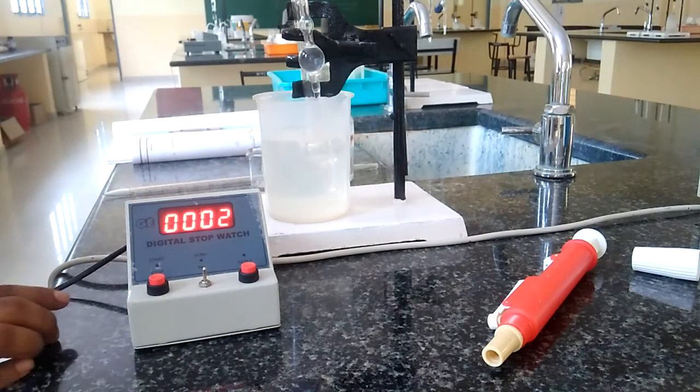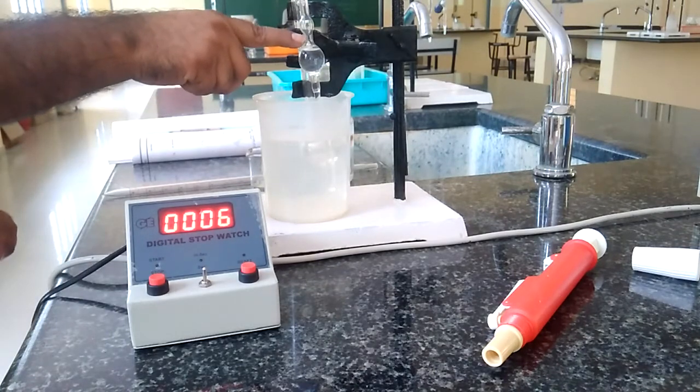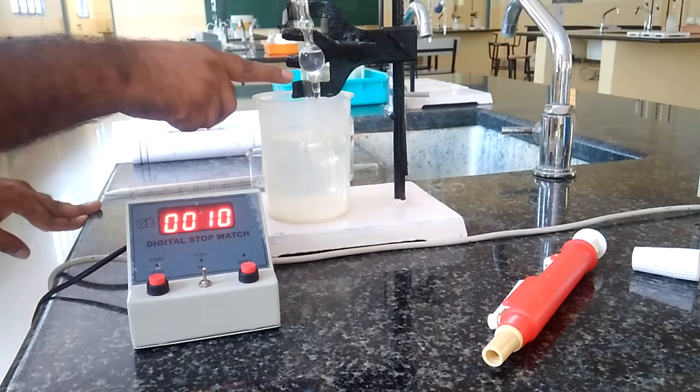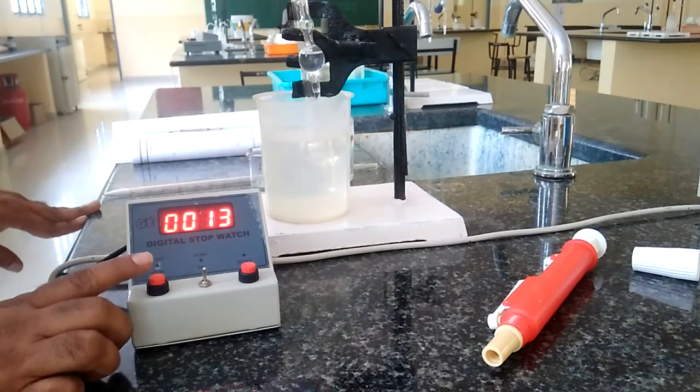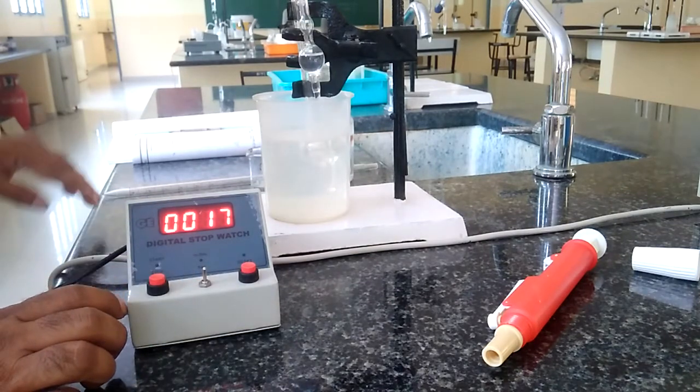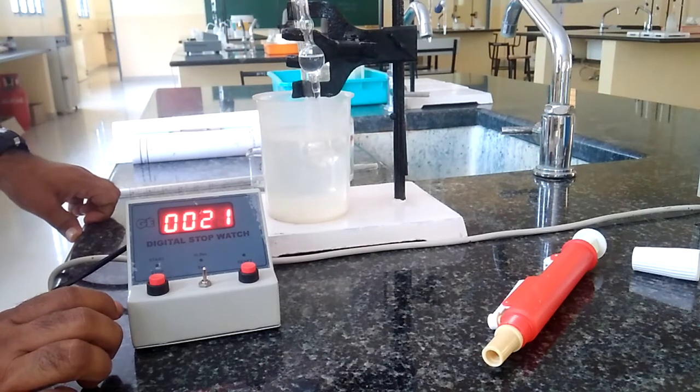I am recording the time of flow from the upper mark to the lower mark. Whenever the liquid touches the lower mark, immediately we have to stop this stopwatch so that we can record the time of flow of liquid from the upper mark to the lower mark of the Ostwald viscometer.